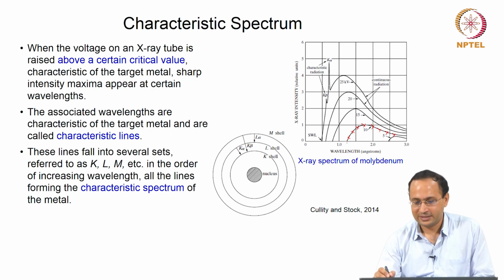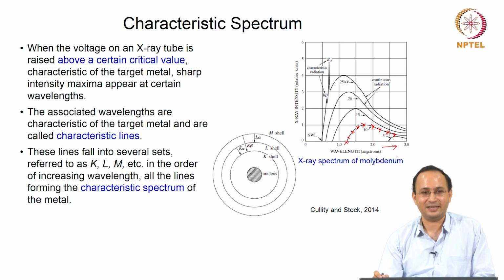First of all, you do not see any X-rays in the shorter wavelength range. Then it starts here, and you have different wavelengths of different intensity. Also, another way of looking at it is that as wavelength is increasing, energy is decreasing.